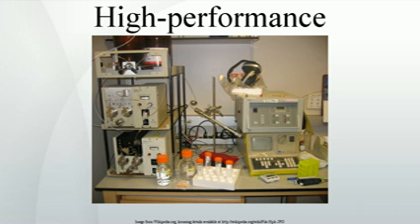The time at which a specific analyte elutes, emerges from the column, is called its retention time. The retention time measured under particular conditions is considered an identifying characteristic of a given analyte. Many different types of columns are available, filled with sorbents varying in particle size, and in the nature of their surface chemistry. The use of smaller particle size packing materials requires the use of higher operational pressure, back pressure, and typically improves chromatographic resolution, that is the degree of separation between consecutive analytes emerging from the column.